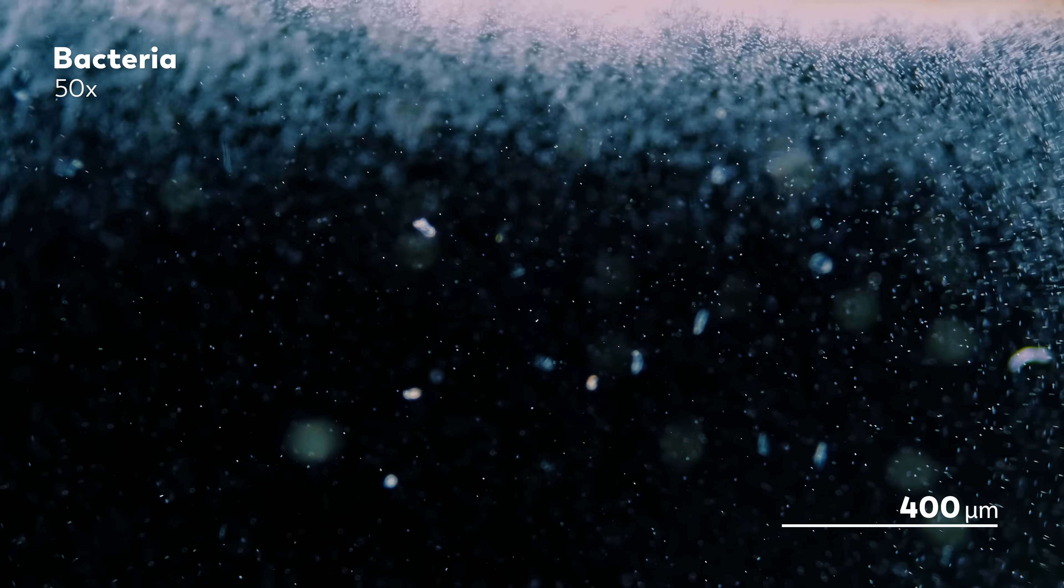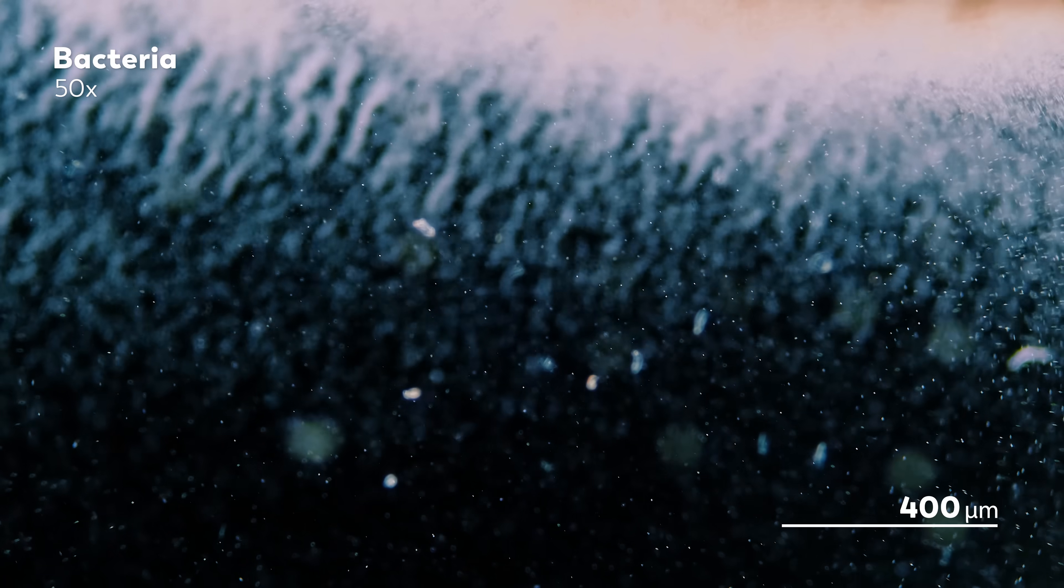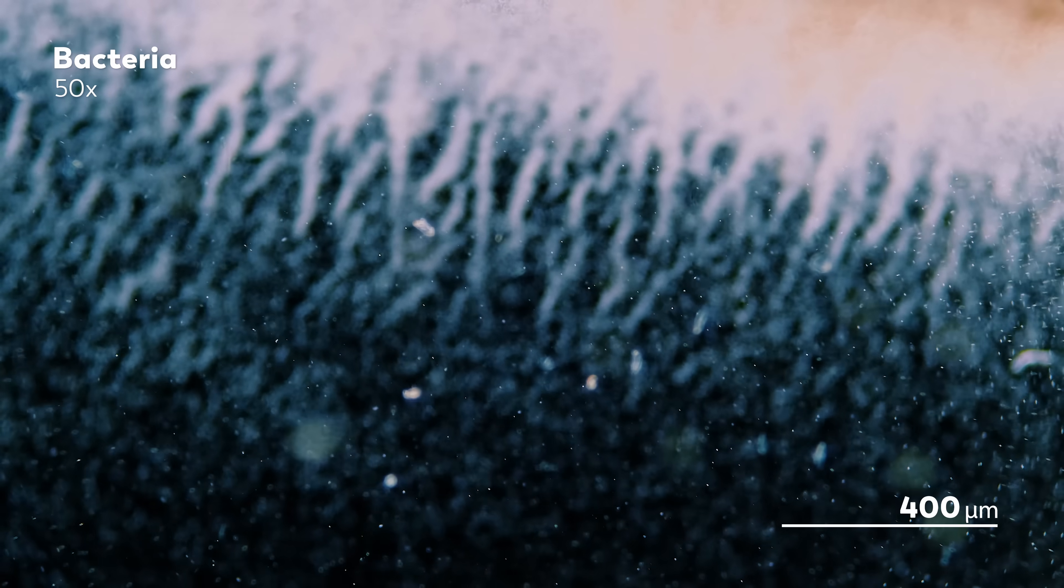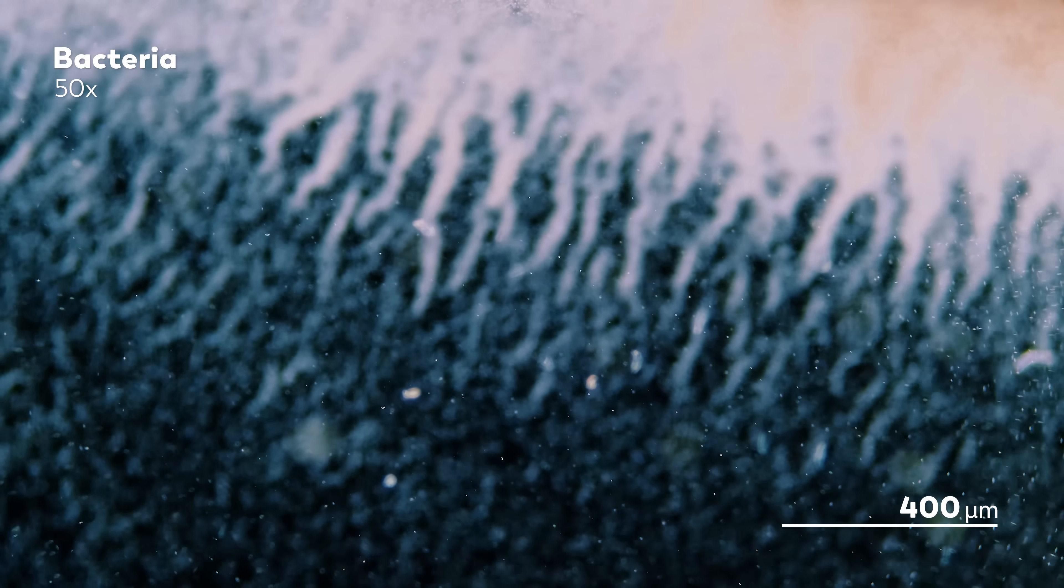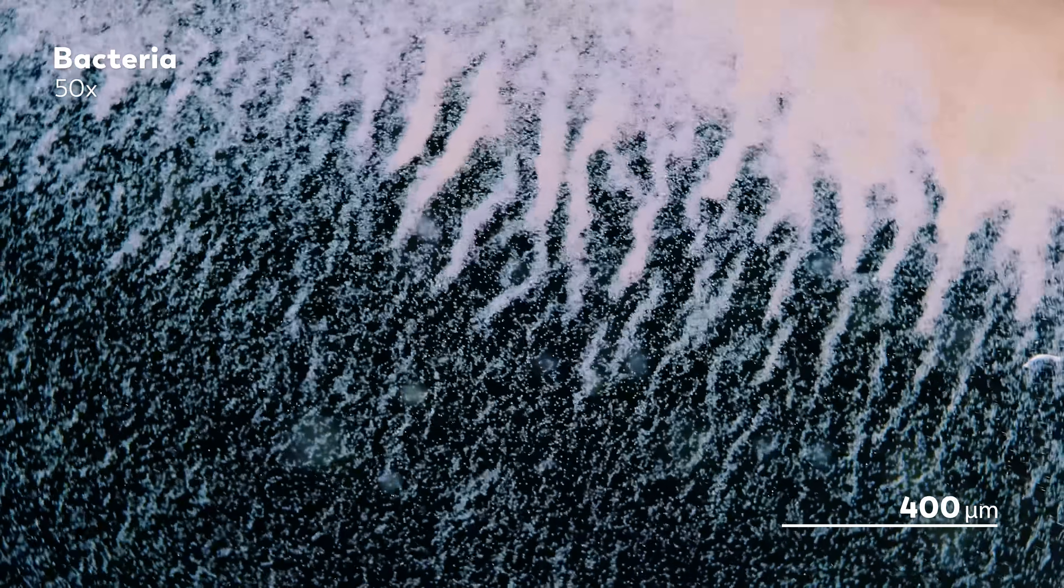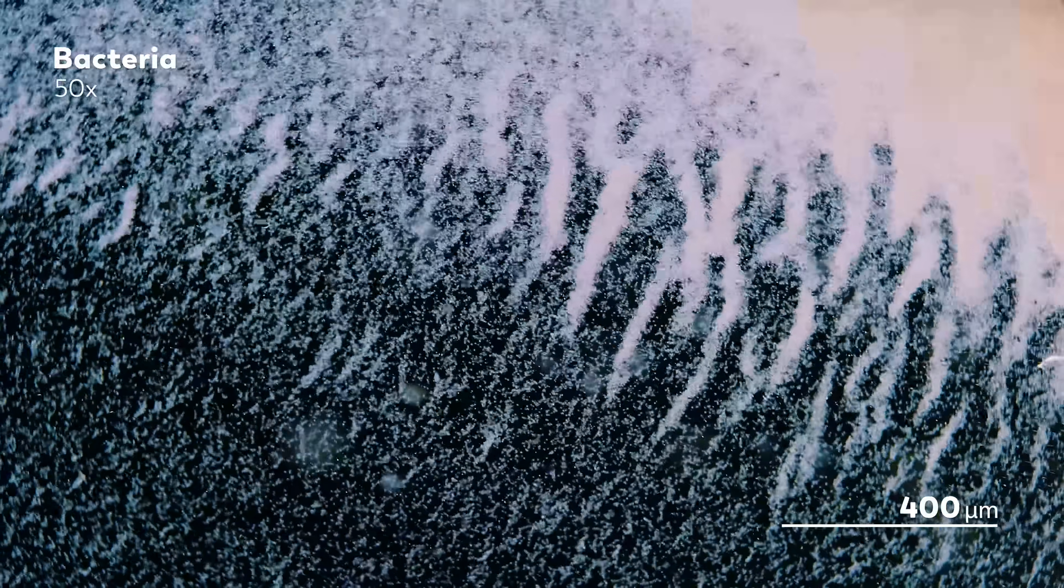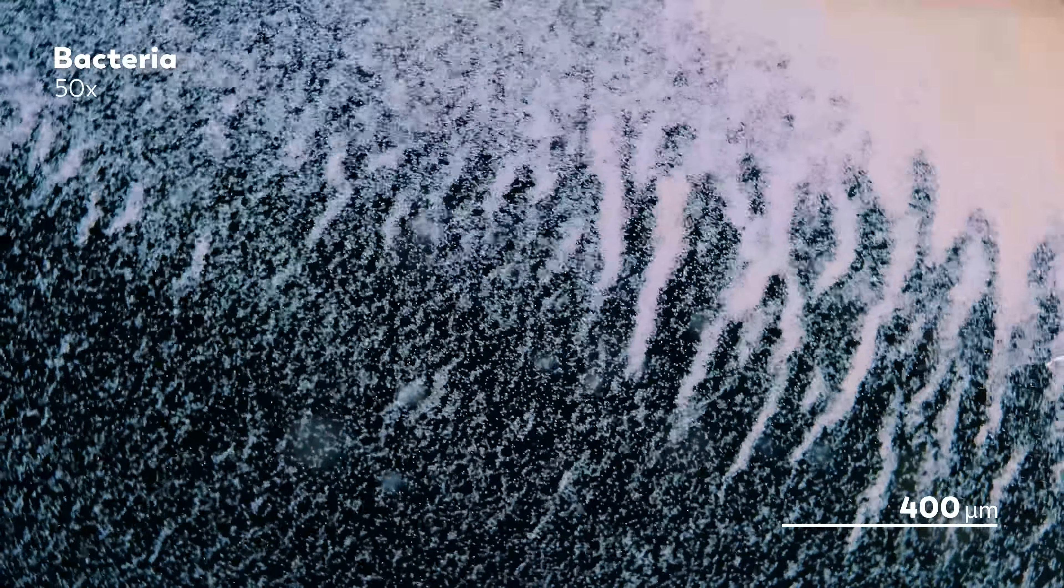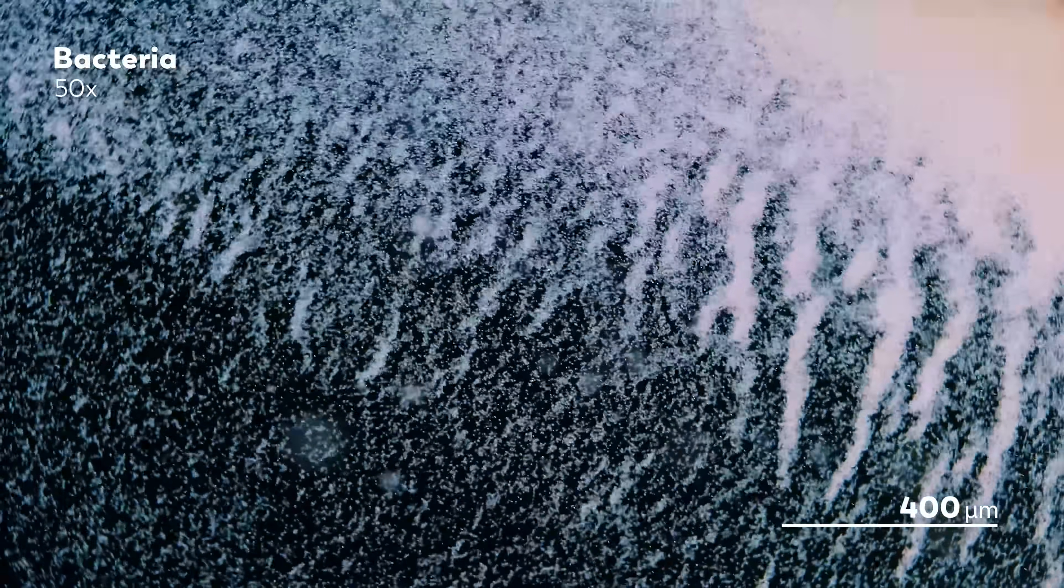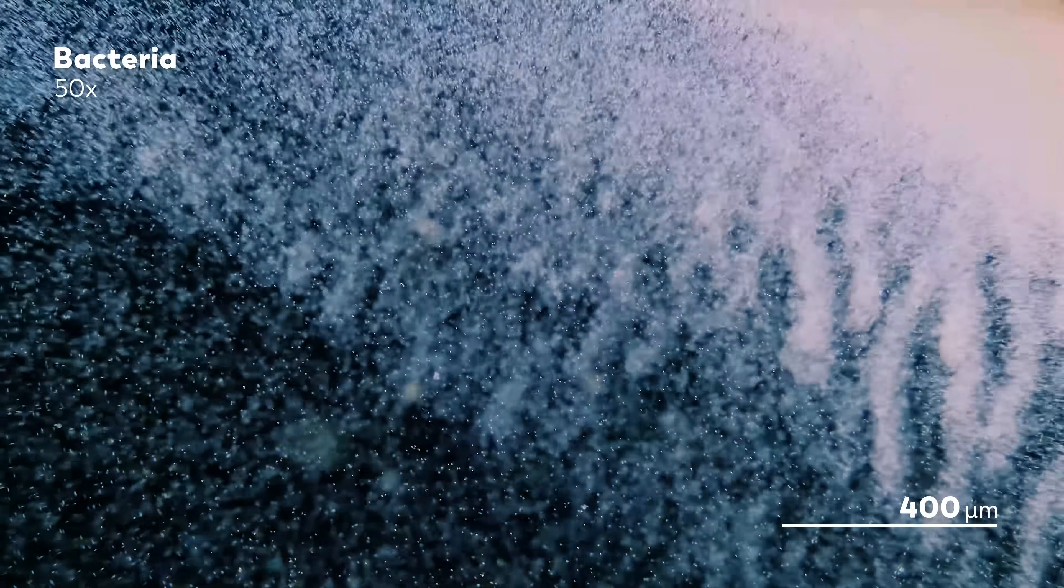So if we've seen this line of bacteria that's all swimming north, what's with the other things that we've been watching, where the bacteria look like they are being dragged in other directions? Well, as soon as James realized that his bacteria were swimming north, he decided to go and grab some magnets to see if he could trick them into thinking some other direction is north instead. So he held the north end of the magnet close to the slide, and the bacteria began to migrate, drawn in the direction of the magnet. And then he rotated the magnet so that the south end pointed closer, driving the bacteria to swim away.